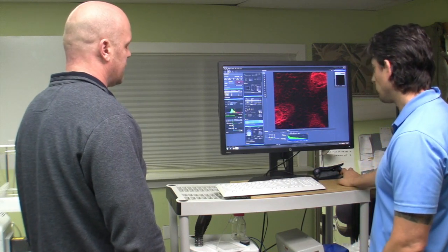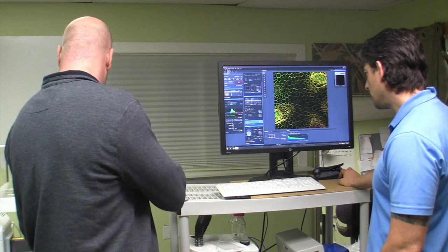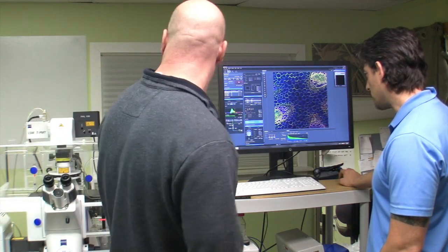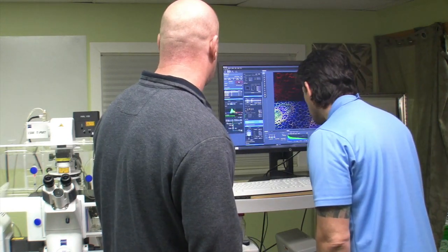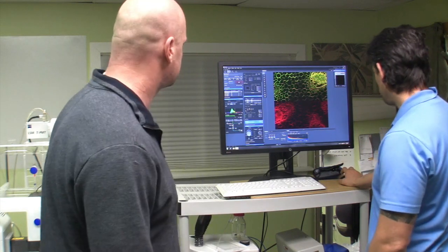Right. So I mean that's got to be a nanometer or 2 nanometers. I mean this is incredibly thin. Yeah. Oh, of course. There's nothing inside. The intervals are 1 micron. Okay.